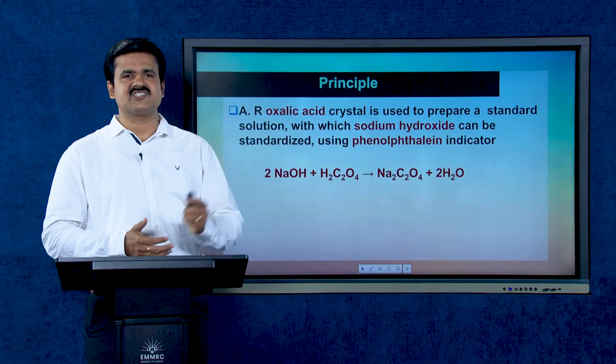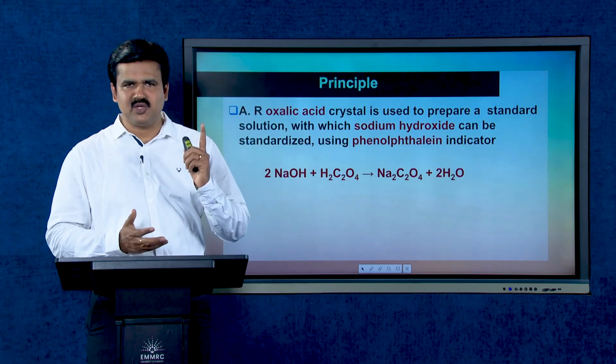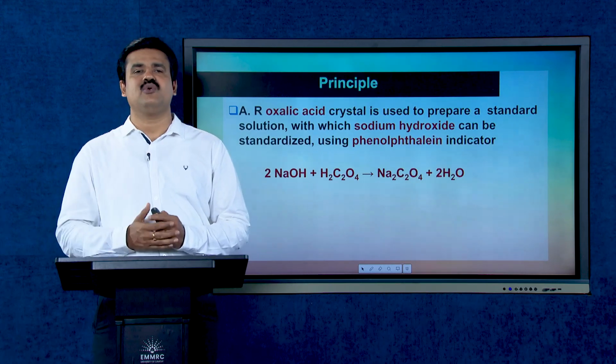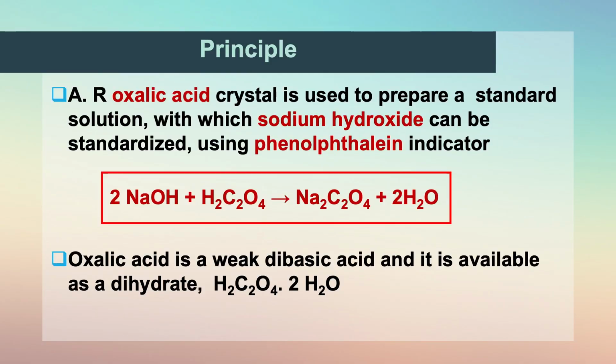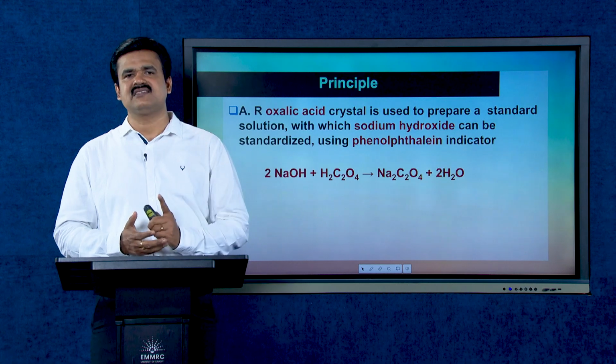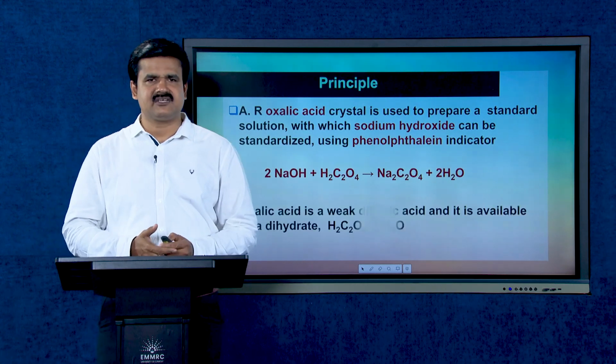And the reaction responsible for the standardization of sodium hydroxide by using a standard solution of oxalic acid lies here. 2 NaOH plus H2C2O4, that is oxalic acid, gives Na2C2O4, that is sodium oxalate, and 2 molecules of water. This is the neutralization reaction between sodium hydroxide and oxalic acid. To perform this reaction volumetrically, we are using phenolphthalein as the indicator.